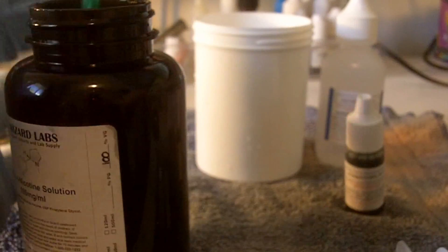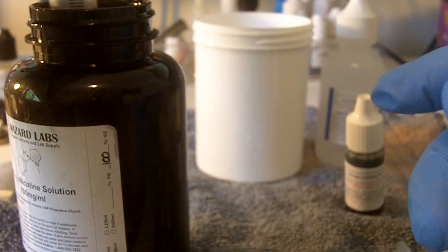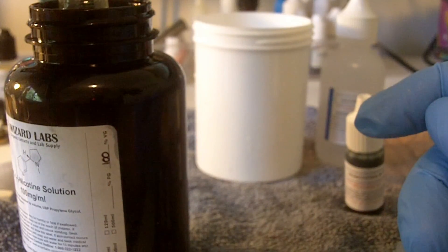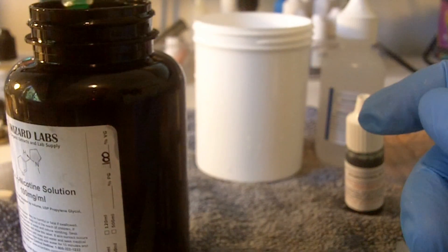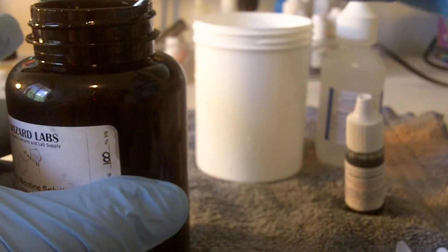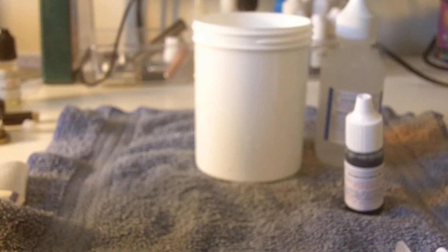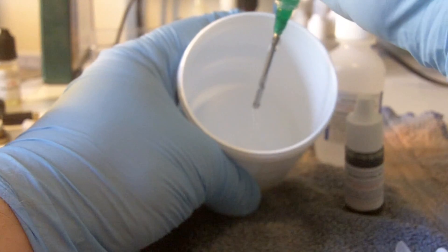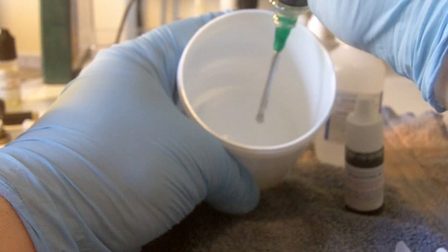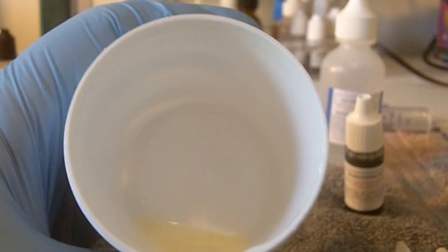You can do this with anywhere from one to three milliliters of nicotine, and I'm going to go ahead and use three. If you use one, you'll still get a fairly accurate number, but the more you use — up to three milliliters — the more accurate your testing should be. The test is only going to be as accurate as the user; it's very important to note that up front. So I've measured out three milliliters of 100 milligram nicotine and I'm going to inject it into our test cup.